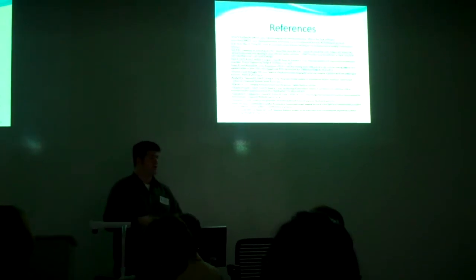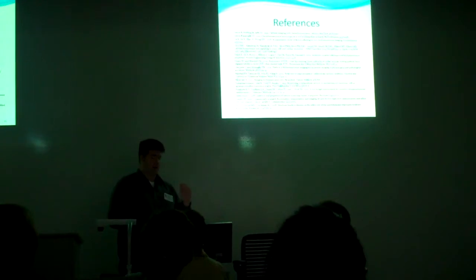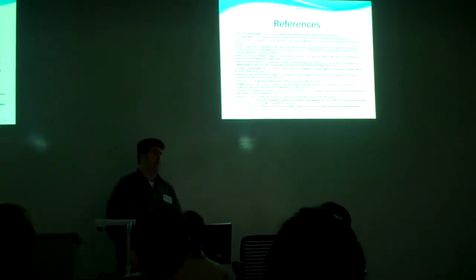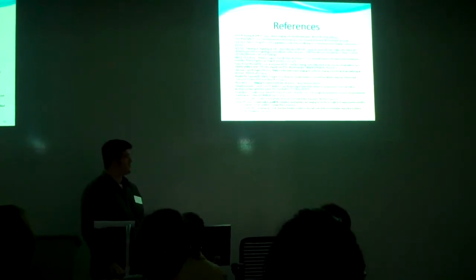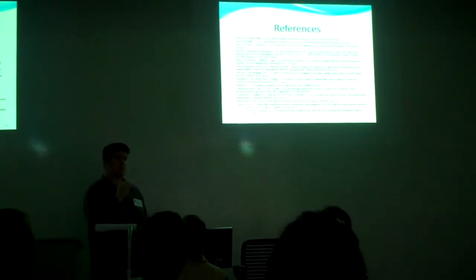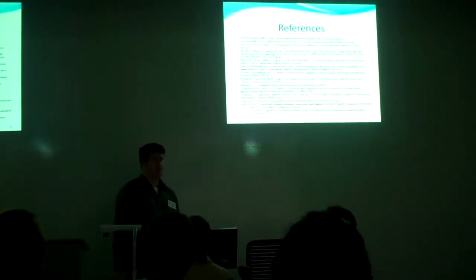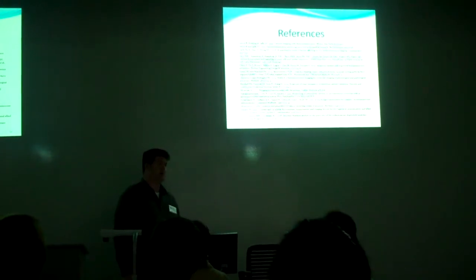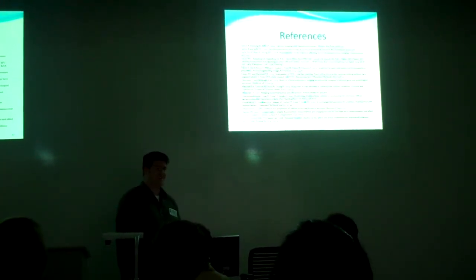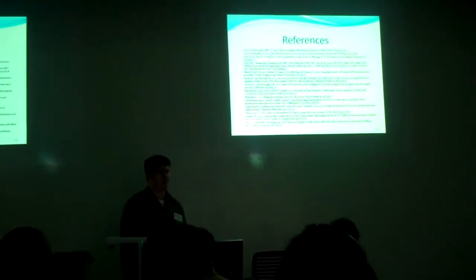Because with a PMT, you don't know where that light's coming from. You just know that it's giving off the light. You know exactly how much in relative light units, which you can calibrate. But if you want pictures, you've got to get a camera. If you're okay with just measuring the amount of light because you're pretty sure where that light is coming from, then I think PMTs are the way to go. And if you get a newer device, they can be expensive. But ours was 20 years old. The technology hasn't really changed that much in those 20 years, so it's perfectly sufficient for our time.